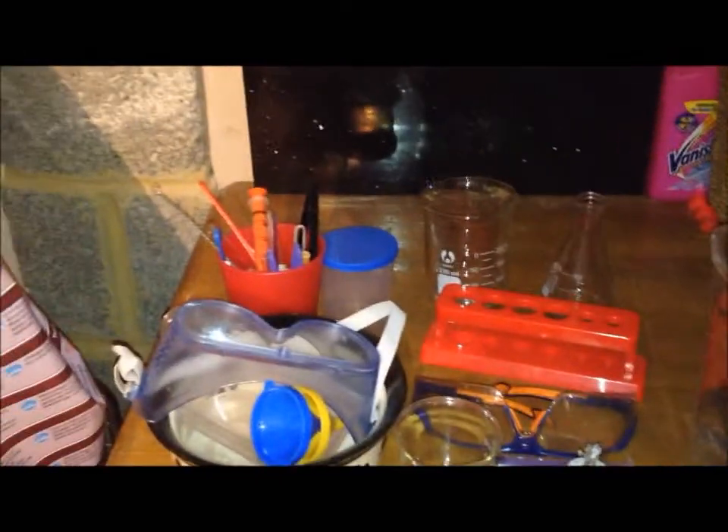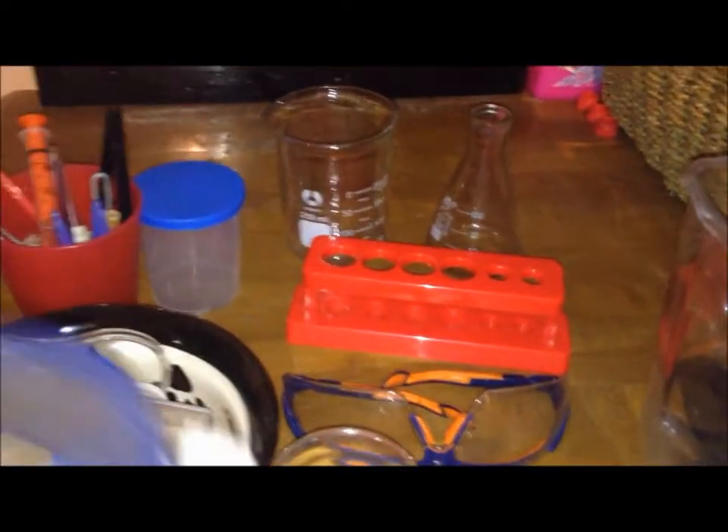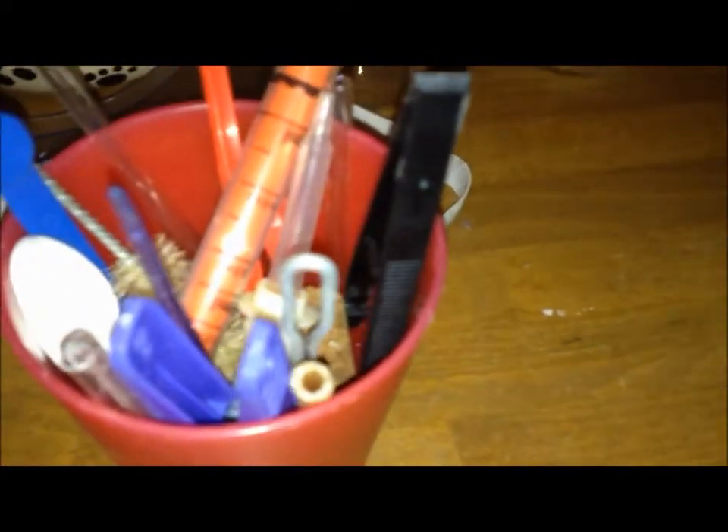Moving on to all my apparatus. Starting off in my old dog bowl, I've got some goggles, some funnels, and some classic petri dishes. A magnifying glass and a little beaker. In my red cup I keep things like a pipette, stirring rod, clothes peg, glass tubing, test tube holder, rubber tubing, corks.